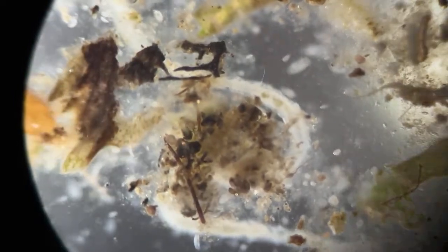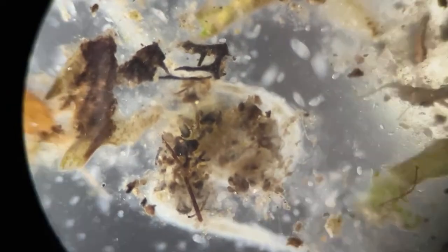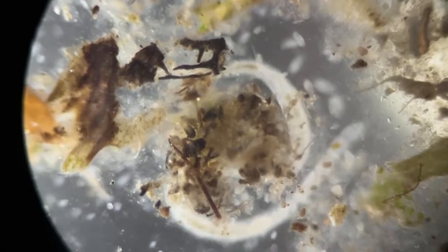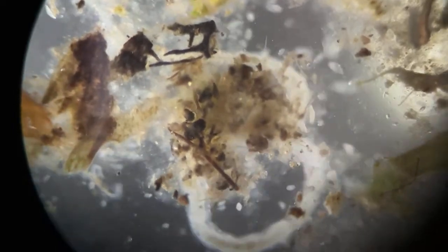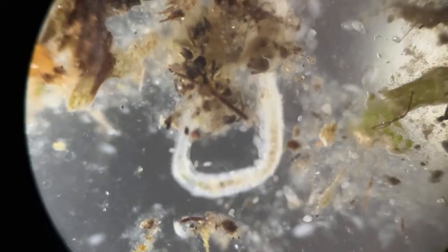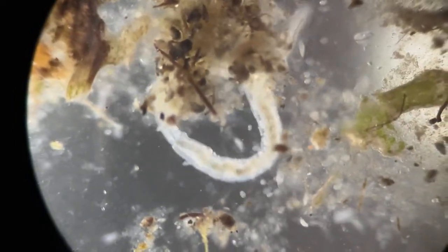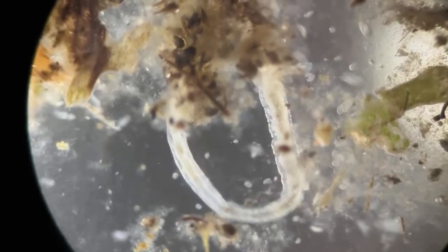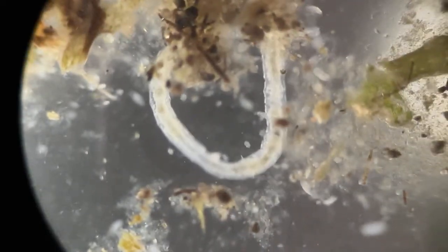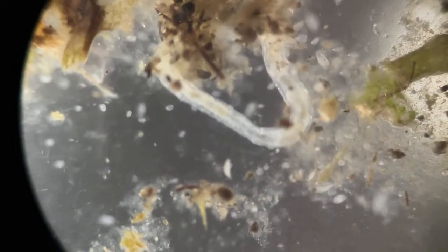No, don't. I was tweaking the camera again. I shouldn't. Waiting for this worm to get out of the debris so that you could see the pulsation of its heart. Patience will reward us, friends. Just a little bit more.